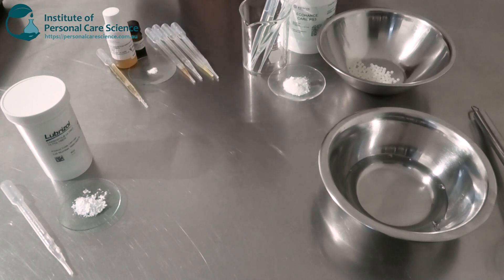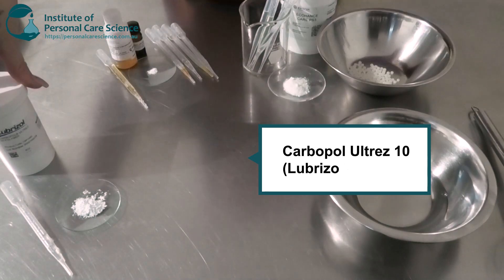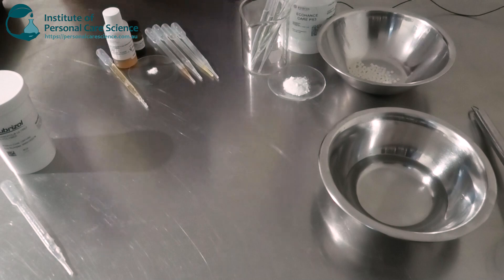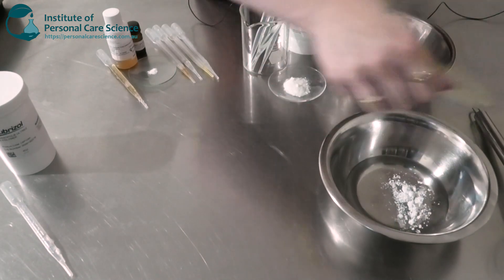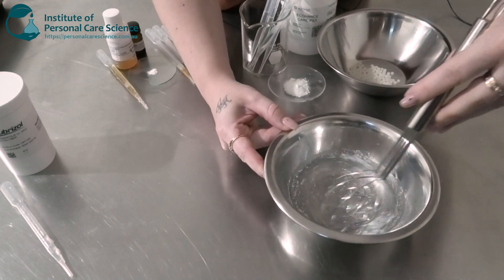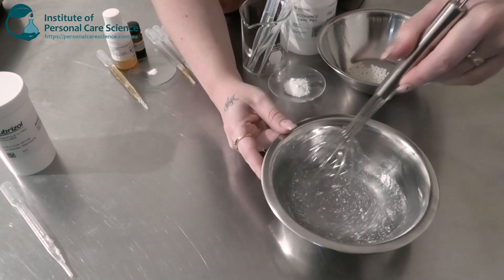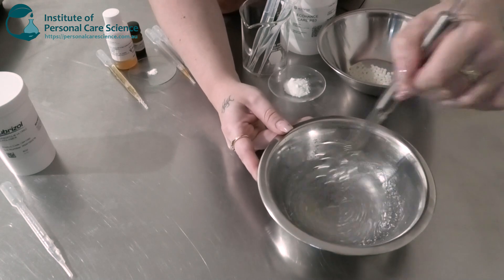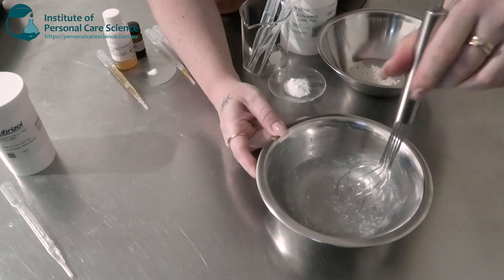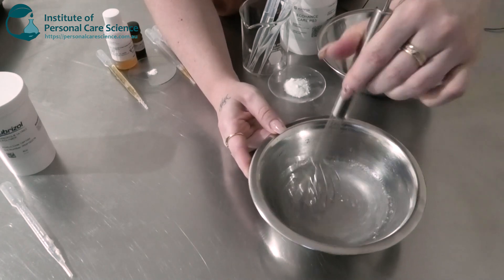To start building the structure of my cream, I'm going to be using some Carbopol Ultrez 10 by Lubrizol. This is a grade of Carbomer. Now this will take some time to dissolve — it's not going to dissolve straight away. What we want to do is just wet the polymer, make sure it's nice and wet and dispersed, and we just continue to stir until it dissolves. You can use an overhead mixer here, something that's low shear, and do continuous mixing until it's fully dissolved.